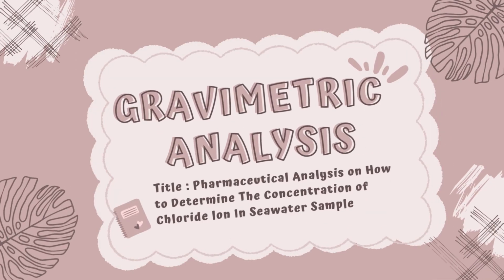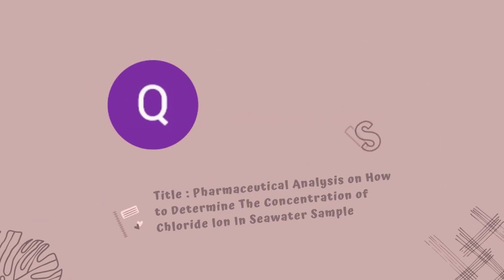Assalamualaikum and hi everyone. Our title for our presentation is Gravimetric Analysis, focus on pharmaceutical analysis on how to determine the concentration of chloride ion in seawater sample.